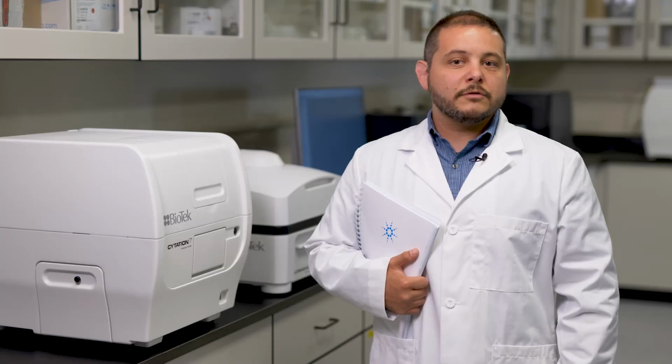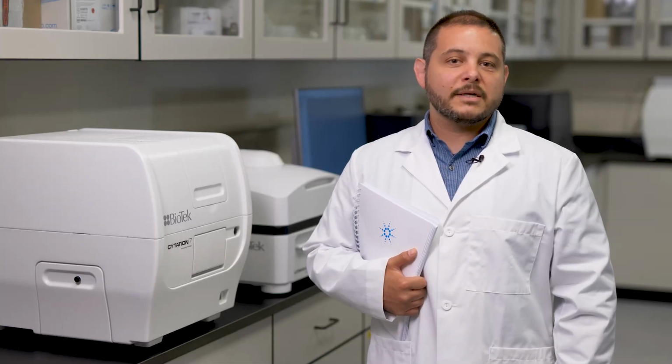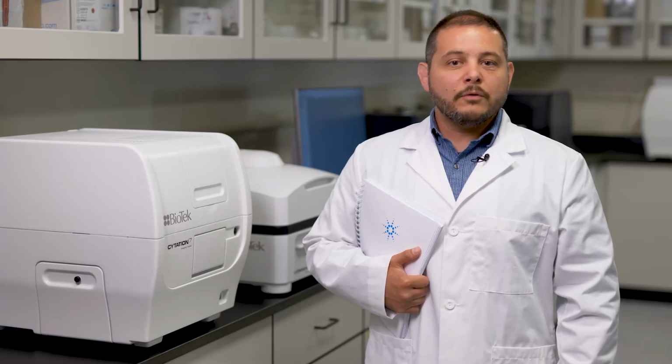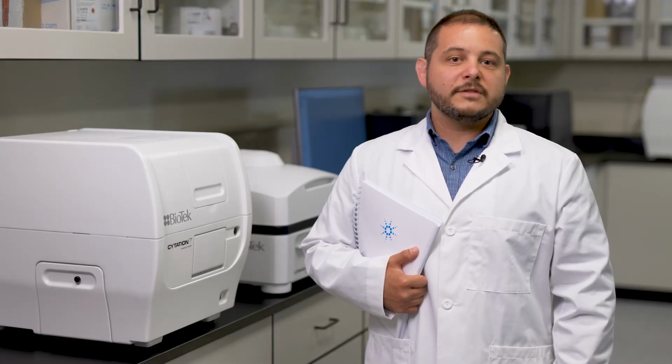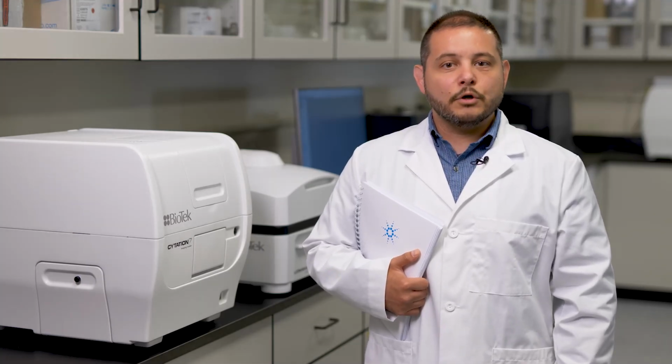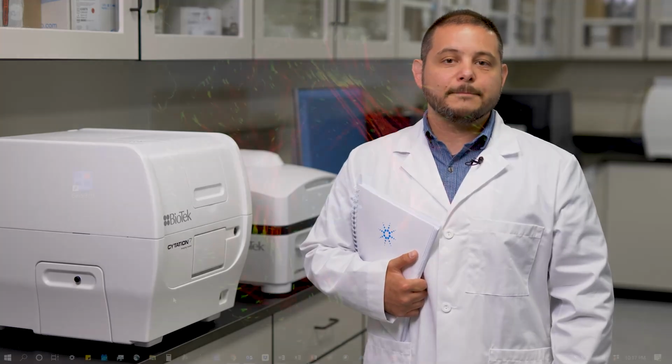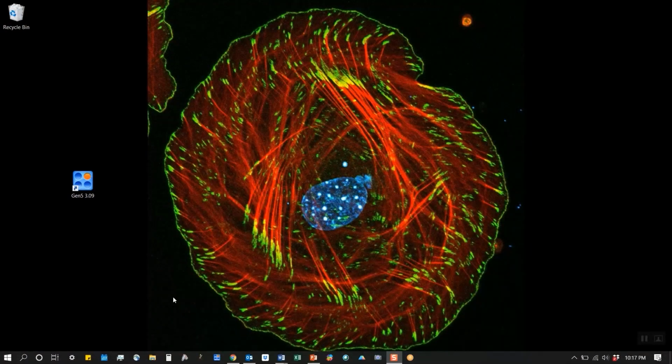In this instructional video, I will discuss important aspects to consider when preparing sample plates for imaging. I will then walk through how to configure Gen 5 to image, analyze, and build a dose-response curve of an anti-cancer drug from the colony formation assay. We will begin the tutorial by imaging colonies using the inverted fluorescence microscopy.